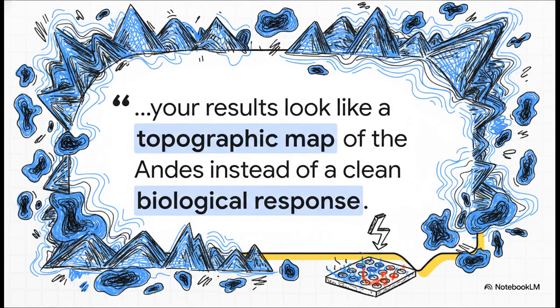You know the feeling, right? It's that specific kind of lab heartbreak. You pull your data, you're expecting this beautiful clean curve, and instead you get this, a total mess. Hot spots, weird smile patterns, drifting values all over the place. It's so frustrating, and man, it really feels like you failed.